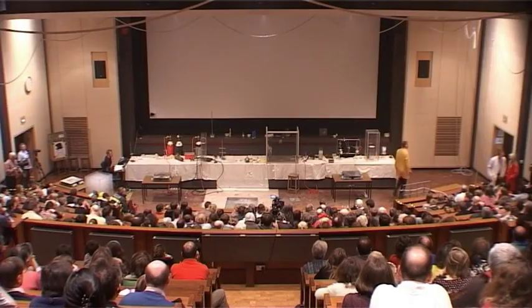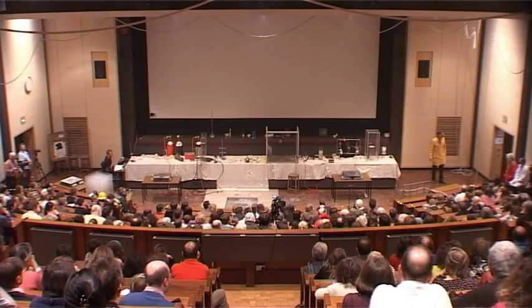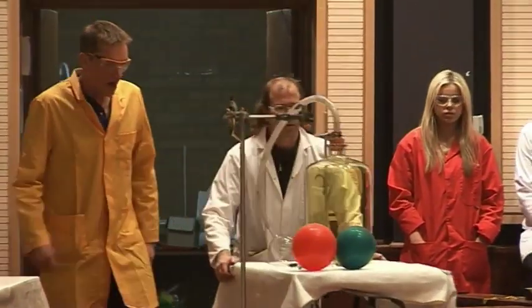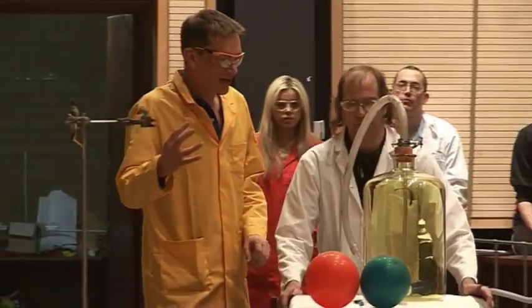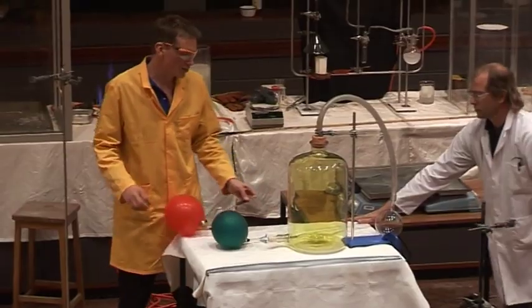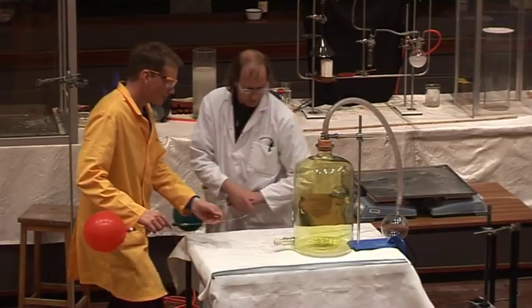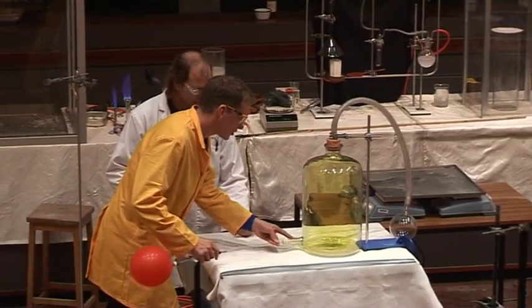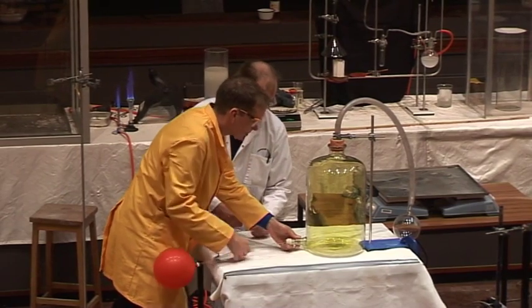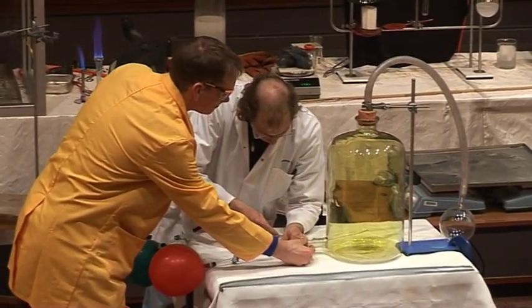We have another flask here. We're going to see if hydrogen can burn in chlorine. Now, this time it doesn't burn all by itself, it needs something to start it, so we're going to use some acetylene, some of the ethine, to start the reaction. So this balloon has the acetylene in, yes? Yes, please, yep. And this balloon has the hydrogen. So I'm going to put the hydrogen balloon into the chlorine. Chris is going to put the ethine or acetylene in.